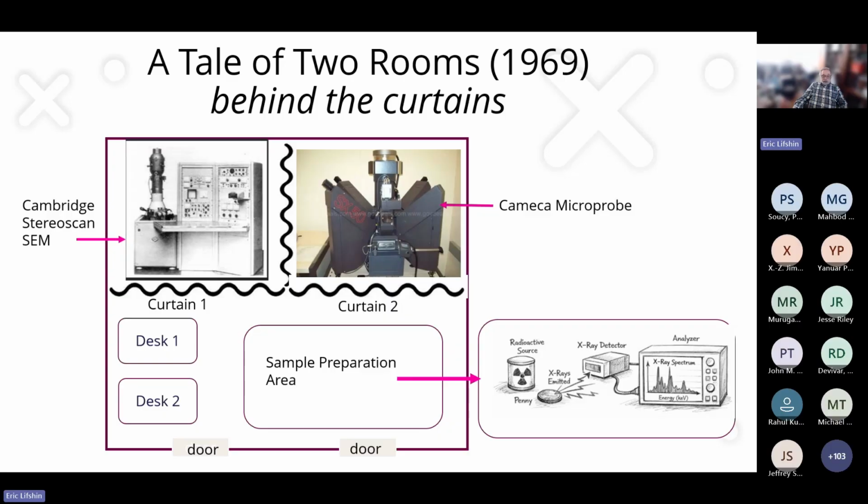And there was my scanning microscope, a Cambridge Stereoscan. At that time, nobody had ever put a solid-state X-ray detector on a Cambridge Stereoscan, which was the most popular microscope at the time. I was to learn later that John Ross had in fact done this with the JEOL JSM-U3 at JEOL in Peabody, Massachusetts, I think.